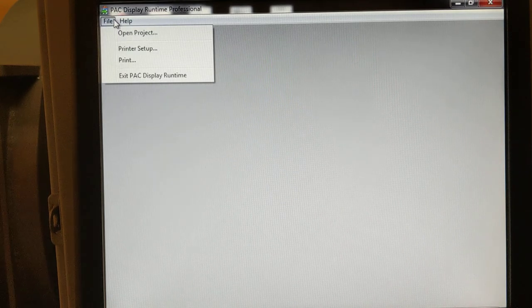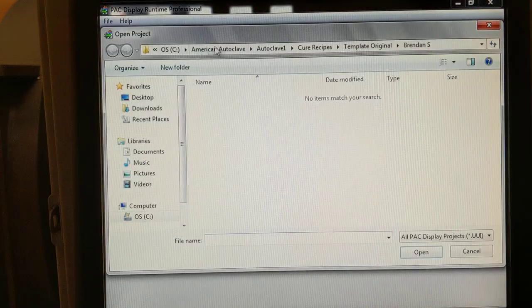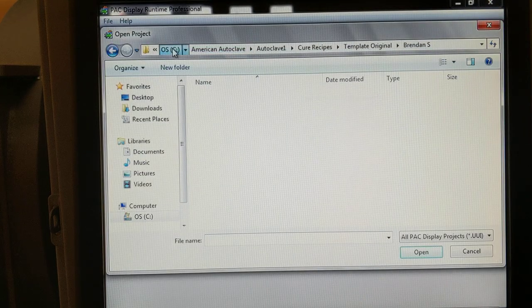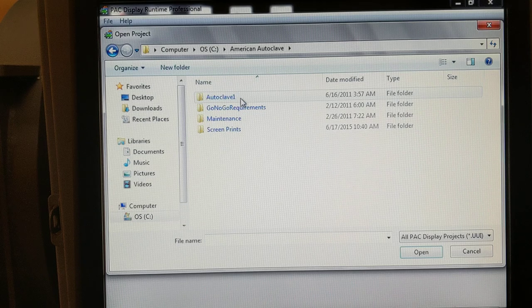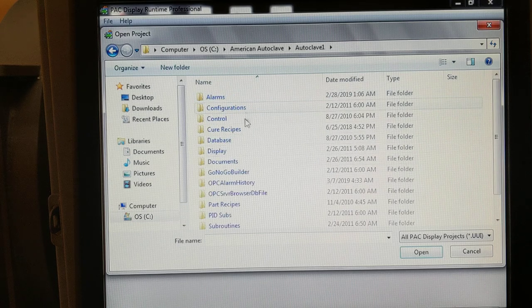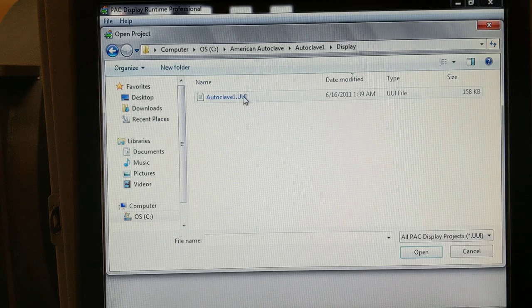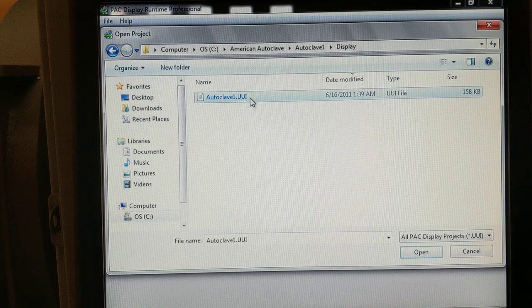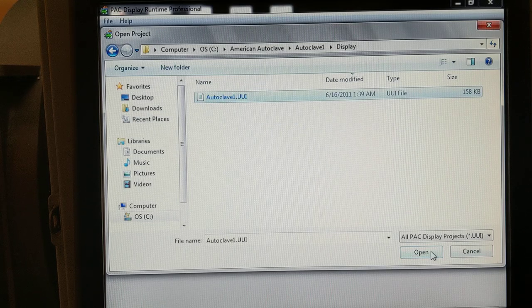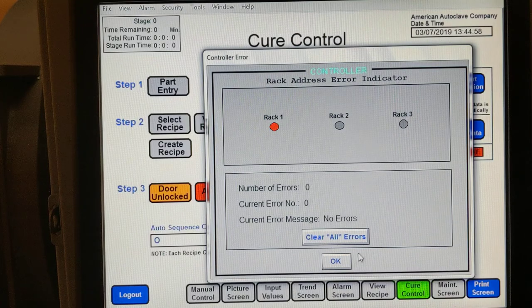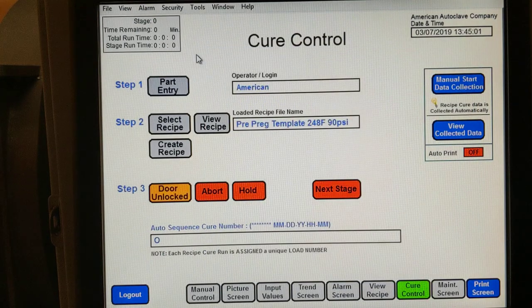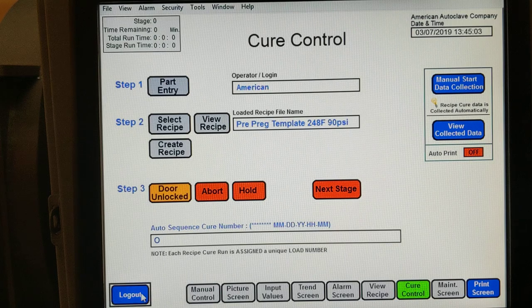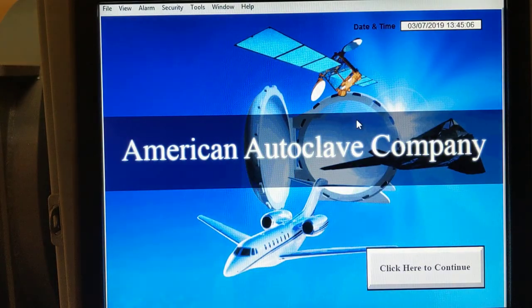To fix this, we need to go to File, Open Project, then navigate to C, American Autoclave, Autoclave1, display, and autoclave1.uui. When you do that and press open, it will restore the software to the way it should be. And that's it.